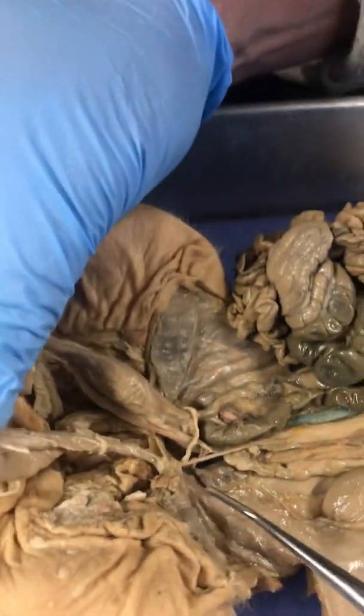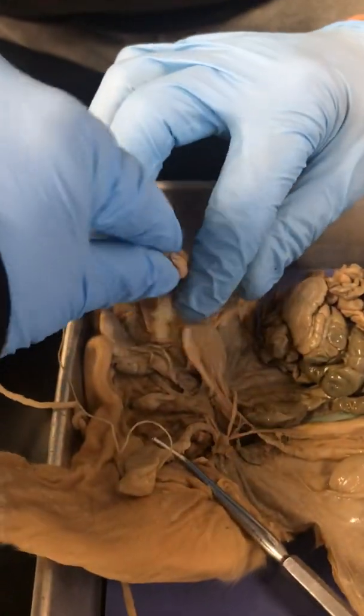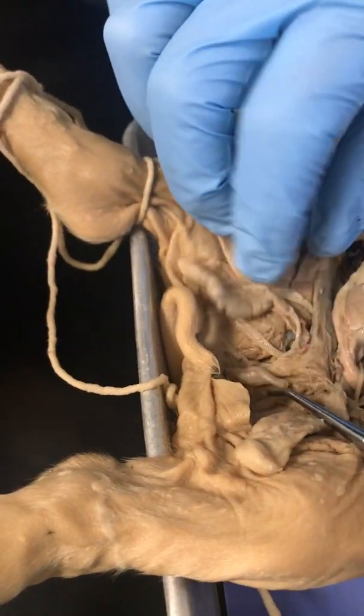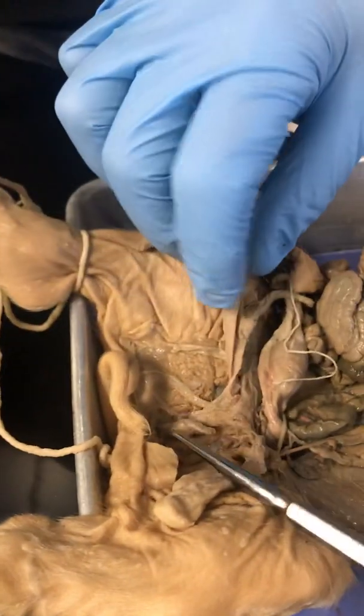Got it. And I think that's pretty much all. Is this considered the scrotum? No, the scrotum would be this sac. This is where the testes would normally sit. And unfortunately, let's see, there's the other testis.